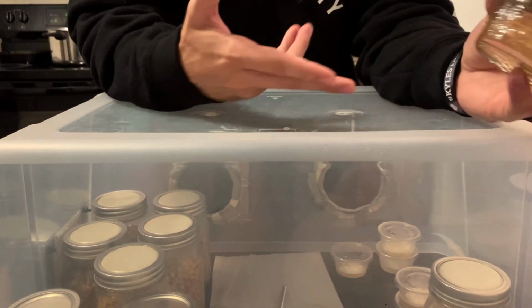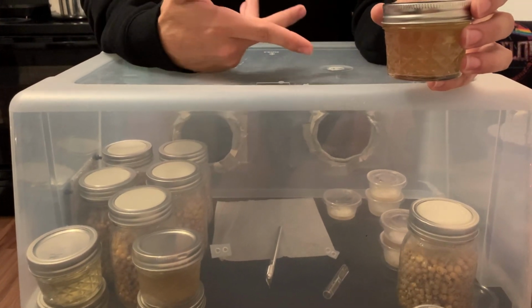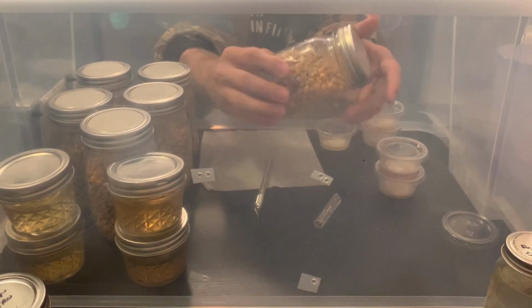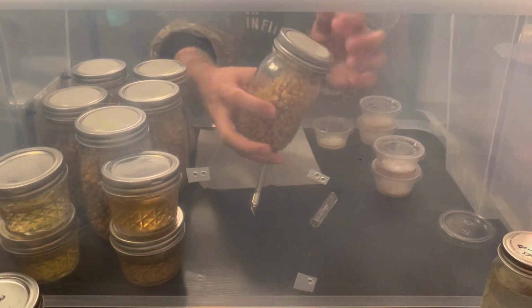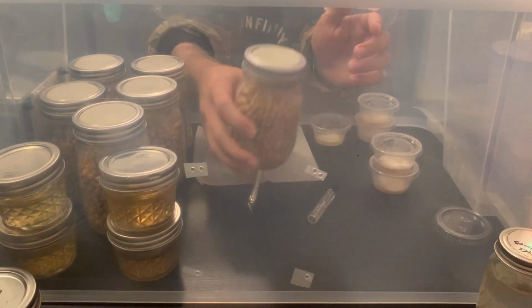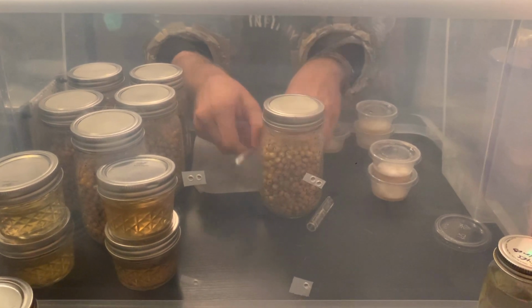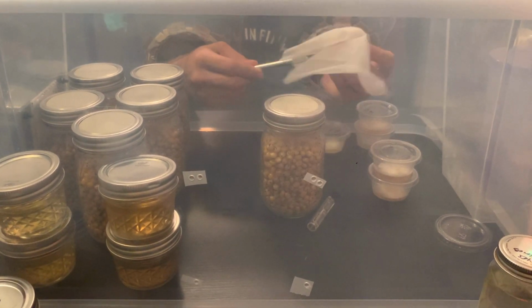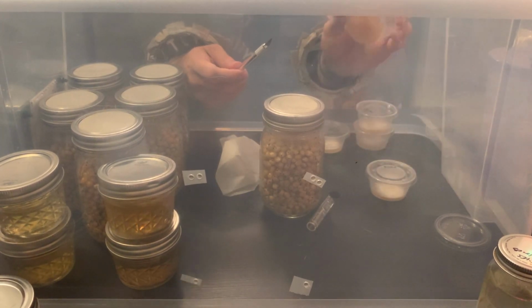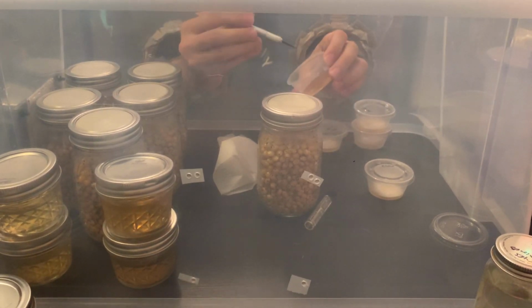So the next step is inoculating these jars we have in here, which kind of takes forever. So I'm gonna show you guys how to do that real quick. Okay, so what I like to do is get a lot of the grain on one side so that when you throw your agar in there, it's gonna land like that, and then you can kind of just bury it under there, somewhere in the middle towards the top. So kind of the same deal as the liquid culture. You wanna go ahead and wipe off your X-Acto because you put it all over the dirty table. And then just gonna get some agar. Again, take a little slice.